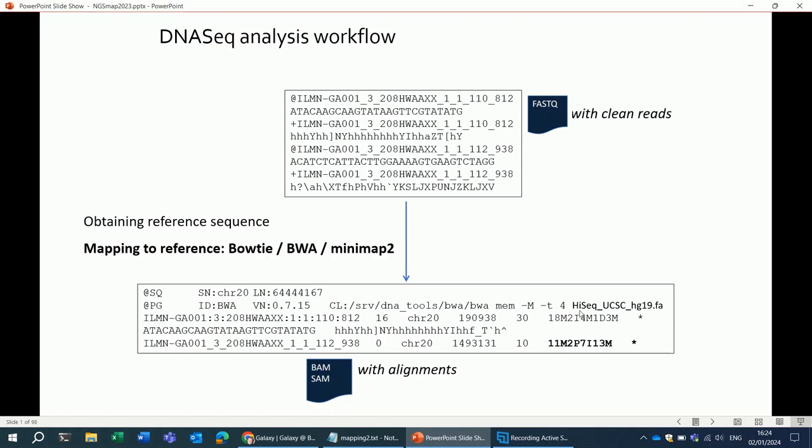You can see here, for instance, the ID of the read, the sequence of the read, and the quality scores. On top of that, it contains the information from the mapping.